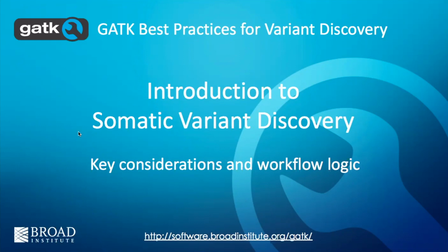So I'm going to give you a little run through of the main challenges that are involved in somatic variant discovery, and I will say this is mostly focused on cancer. There are forms of somatic variation that are obviously not cancer. Cancer is kind of the extreme form when things really go wrong. But we're going to focus on cancer because that's kind of the most common use case that we deal with. And so I'll talk about what's more challenging about somatic variant discovery compared to germline, and what are the adaptations that we make to the workflows to compensate.